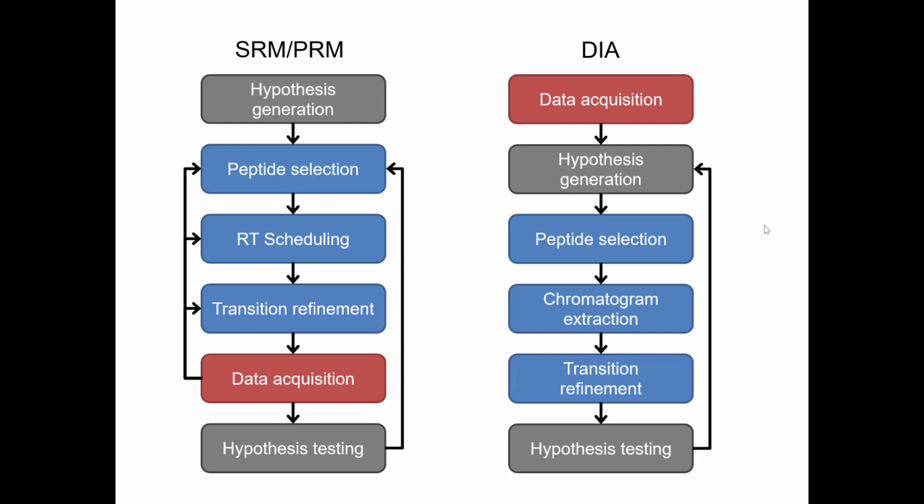And if you find out that you wanted to add some more peptides into the mix, you can just go back and look at that same raw file and just start looking at that analysis or data set again. So this is a huge benefit over looking at SRM or PRM data, at least in terms of the overall workflow. Most of it can be done at your desk and relatively quickly. You don't have to keep going back to the mass spectrometer or bugging your tech to process or build more sample or whatever. Okay?